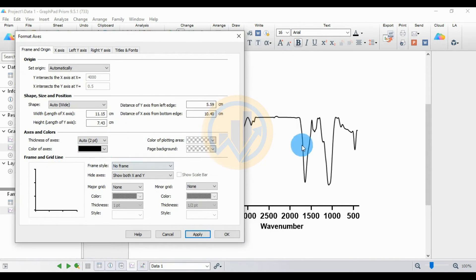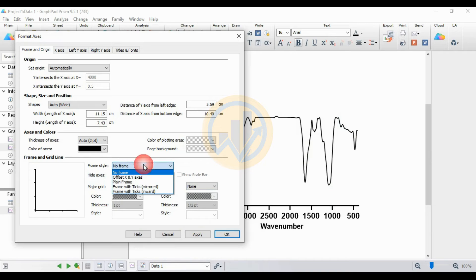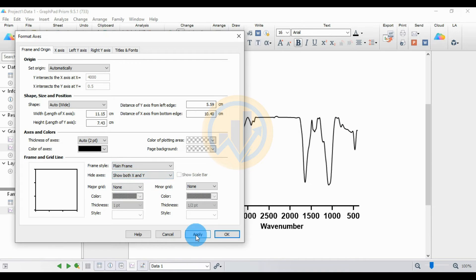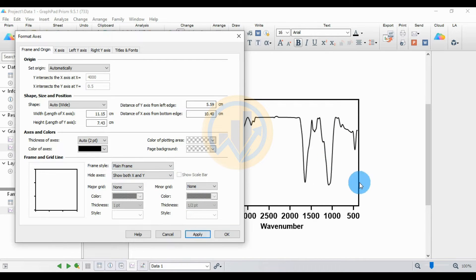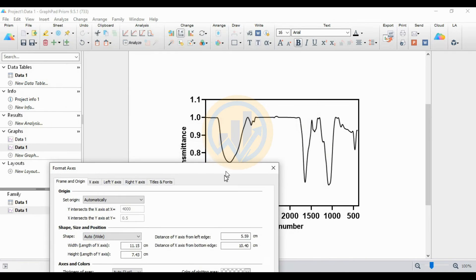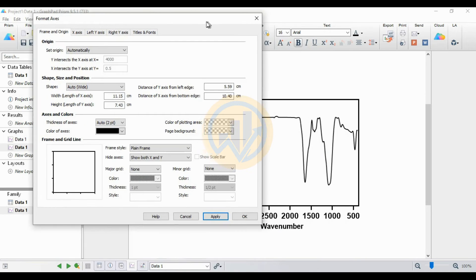Go to the 'Frame and Origin' options. Select the frame style — change from 'No Frame' to 'Plain Frame', then click Apply. The plain frame is now applied to the FTIR graph in GraphPad Prism.